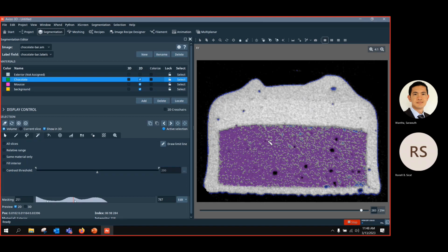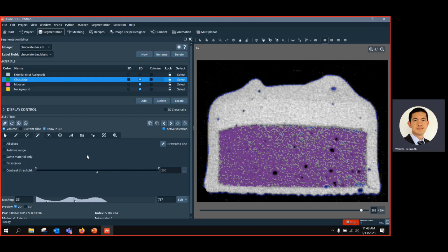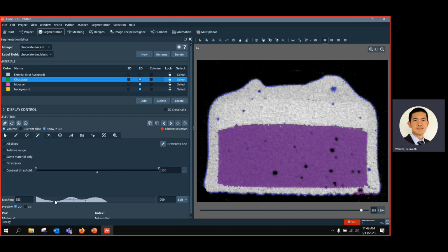We have to do separate things. We can do it in one go. So you can use this, and we can show you in the next example, you get more understanding of multi-material segmentation. But here I just want to show you the very principle of each tool first, and then we go to a more difficult example, because to demonstrate some tools you need some specific feature.